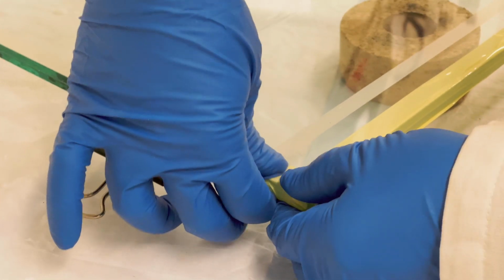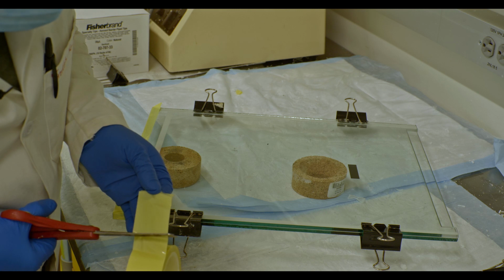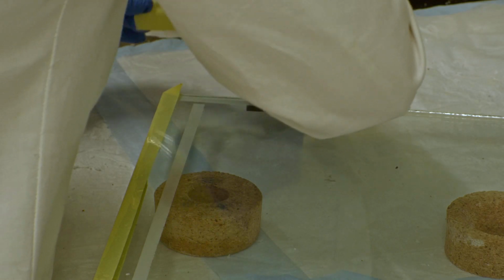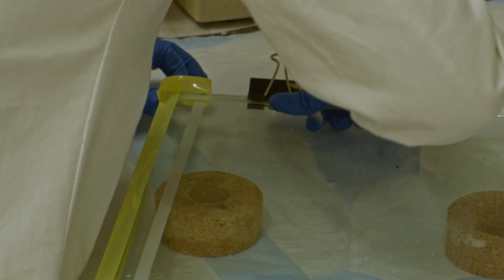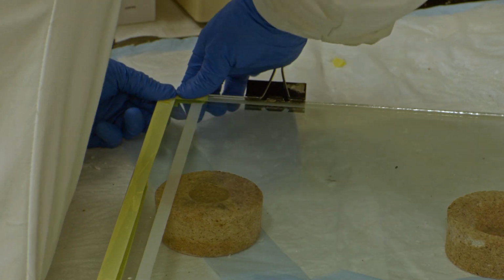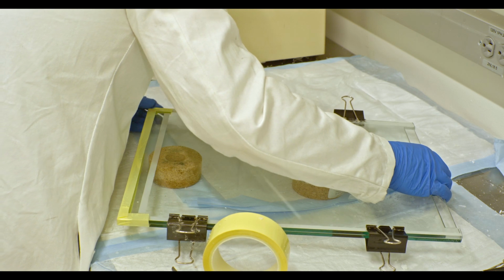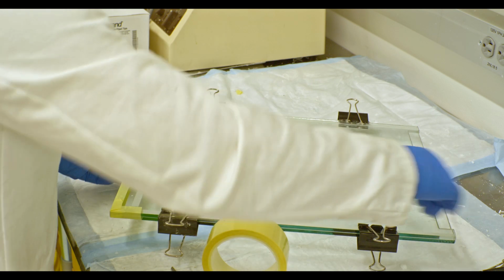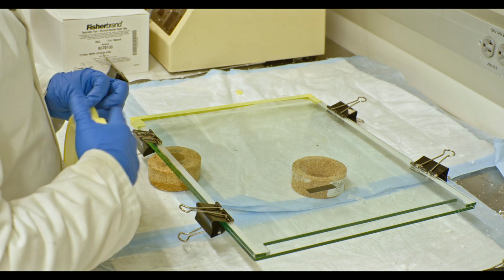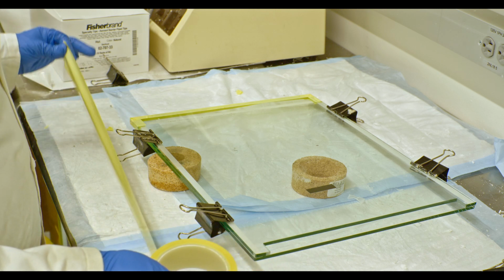Okay, that's one corner. Make sure there's no bubbles. There you go. Right. And that's the second corner. All right. Now, just to make sure, I'm going to also tape the sides of this plate. So again, get a piece of tape, a little bit longer than the actual length of the plate itself. If it's a little too long, you can put some of the excess down here at the corner. It doesn't hurt to have more tape at that corner.